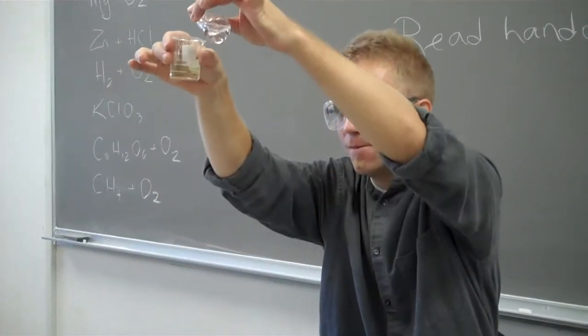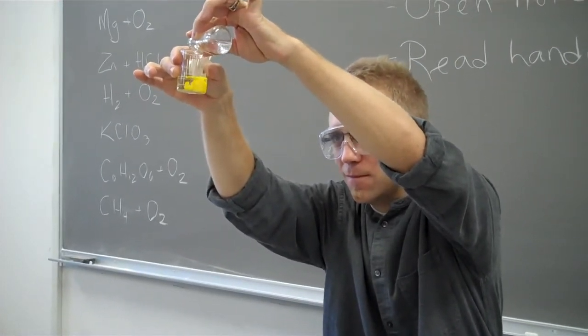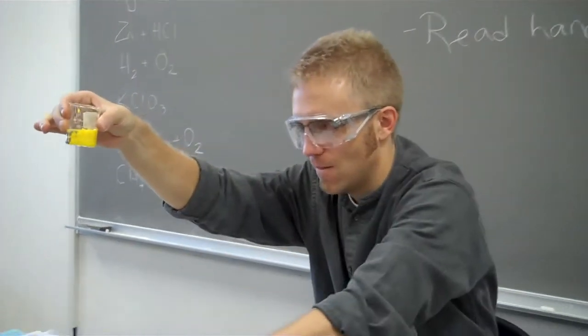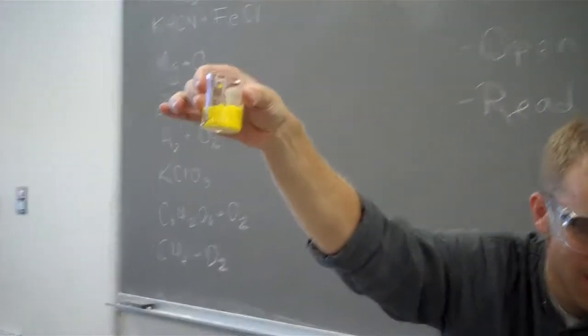Explosions! It's so cute. Look at the little bottom. Ooh! Ew. It's the same kind of dip. That is cool. It's so cool. It looks very thick in there. It's like oil. It looks like oil and water separating.